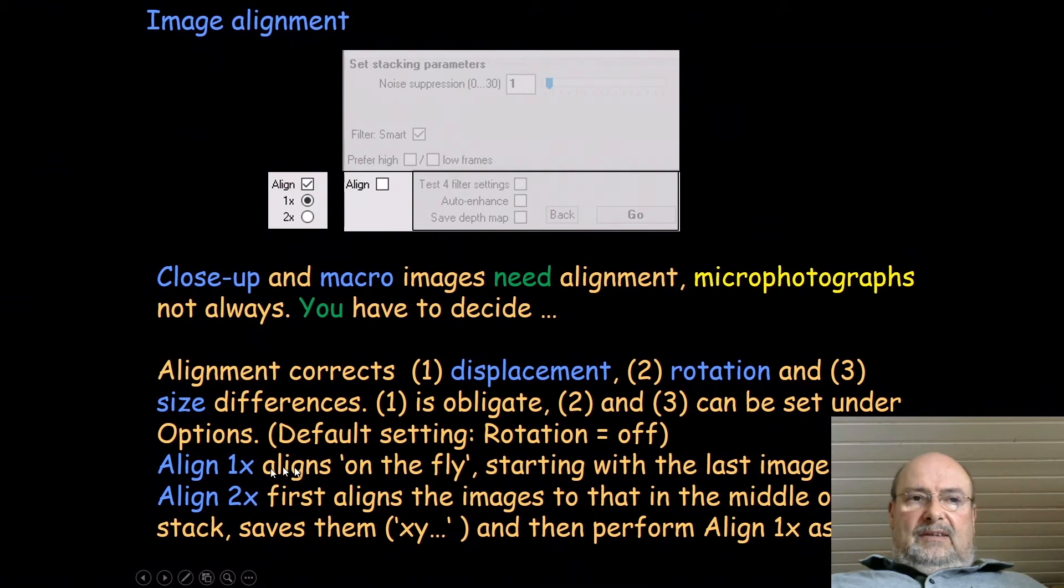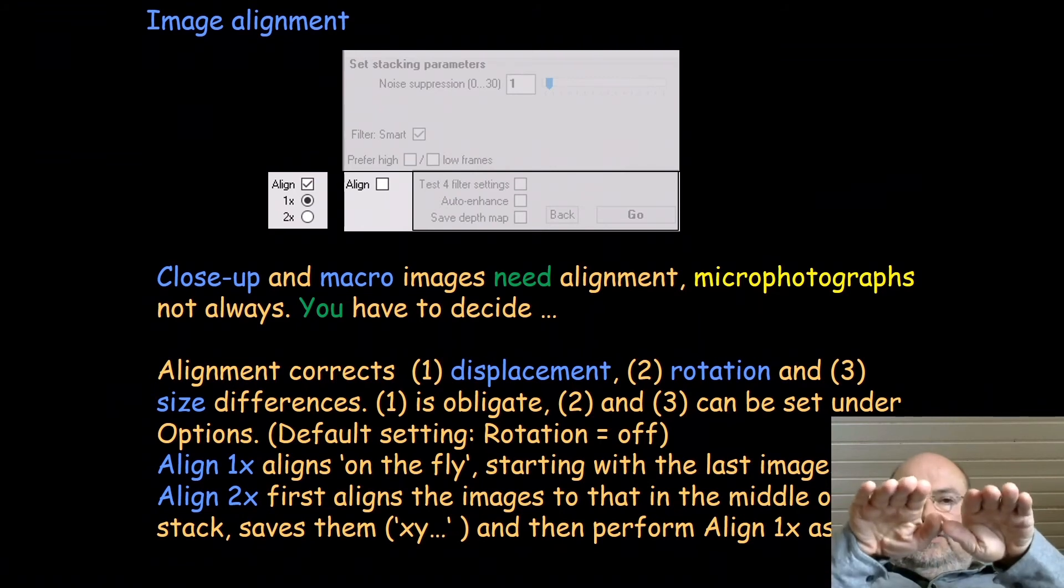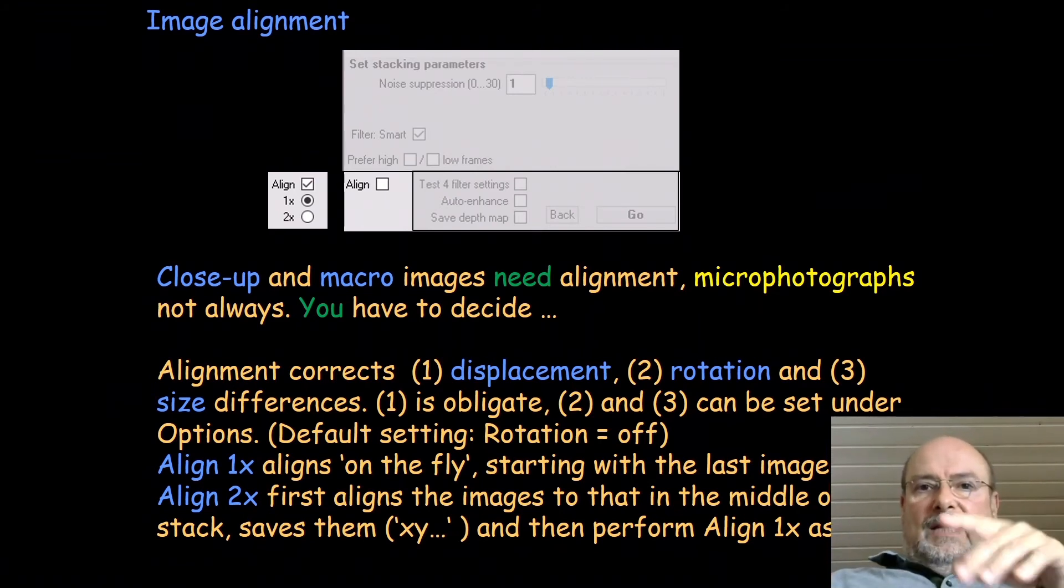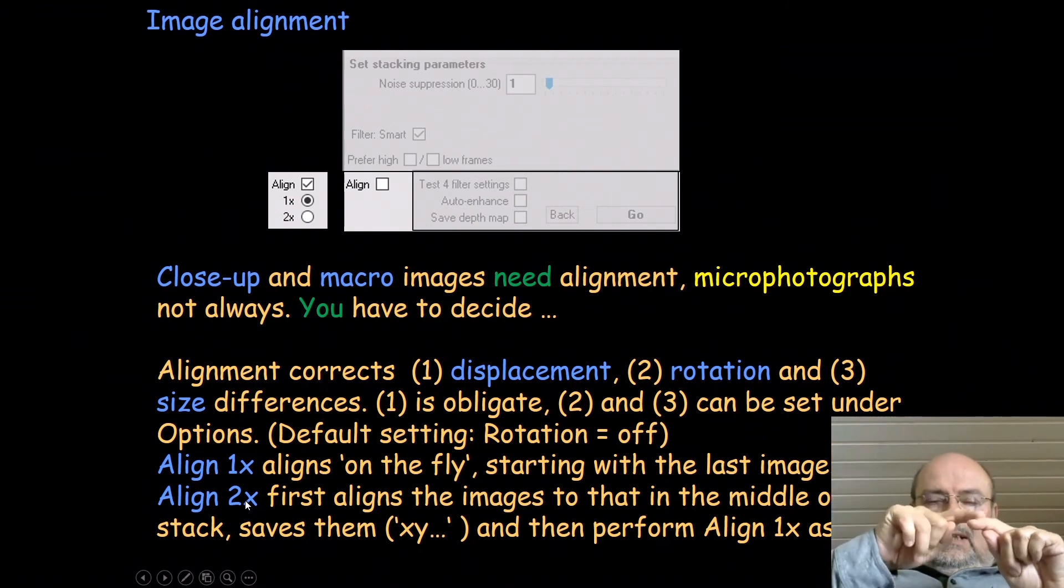There are two choices: either once or twice. If you do it one time, it does the alignment on the fly during stacking. Stacking starts with the last image and then the images are analyzed and everything is aligned to the last image. If you do it twice, there will be a first one where all the images are aligned to that in the middle of the stack. Then the results are saved with a new name and then align once is repeated as well. The advantage here is that the distances you have to cover are smaller if you start in the middle compared to the start at the end.